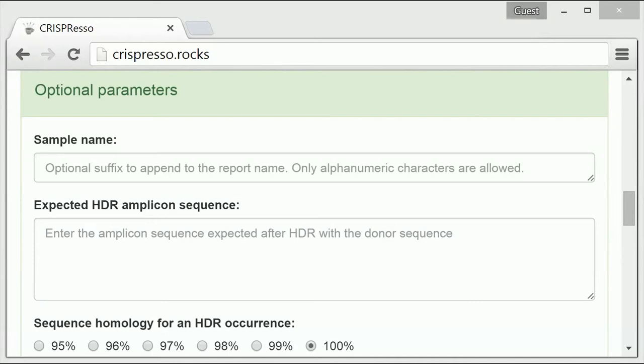In order to ensure CRISPResso analyzes your data in the best way, there are several optional parameters that can be adjusted to fit your needs. So let's go through each of these optional parameters one by one.